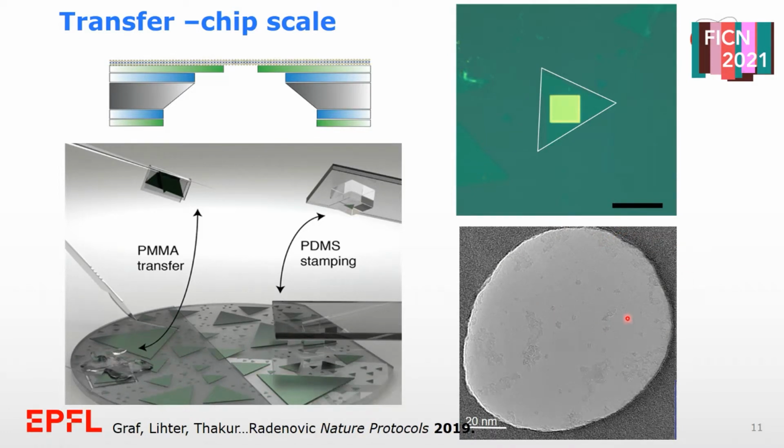Then again, looking with the transmission electron microscope, we can identify the region where we have this 2D material membrane. At this magnification, seeing the membrane is a little bit difficult, but if you focus on my cursor, we see basically contamination from hydrocarbons or leftover PMMA. These are these wiggly things, but trust me, below that is a thin membrane of a 3-atom thick material, which is called molybdenum disulfide.